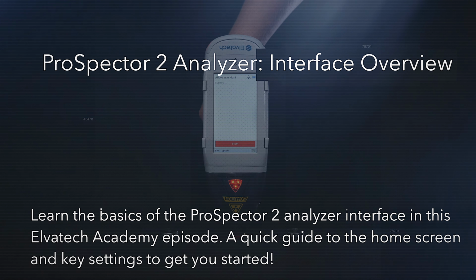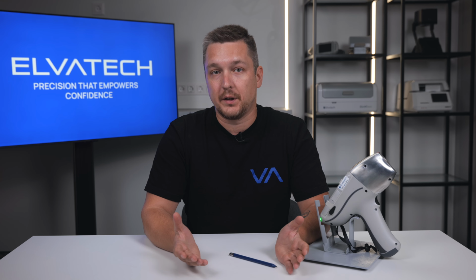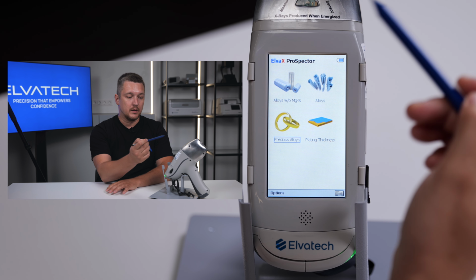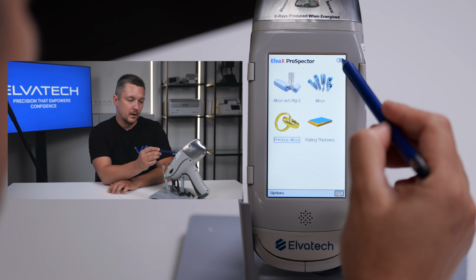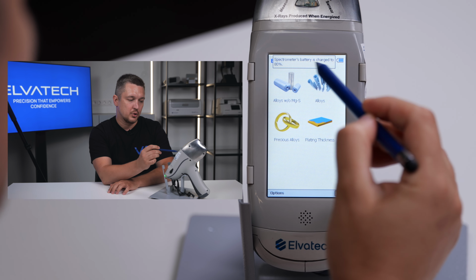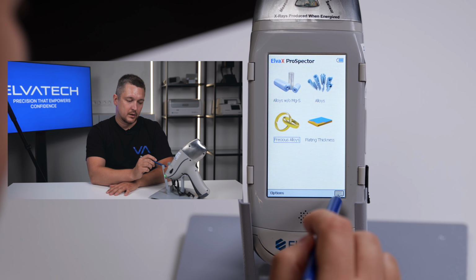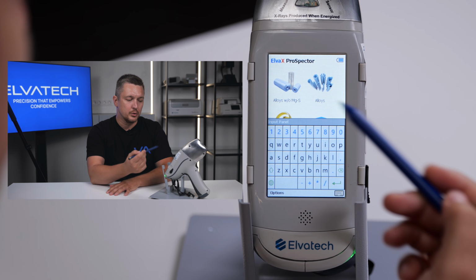So let's get started. After you turn on the device, enter your password and accept the radiation safety notice, you will see the Analyzer's home screen. In the top right corner, we have the battery icon. You can press it once and you see the battery charge. We have 80%.